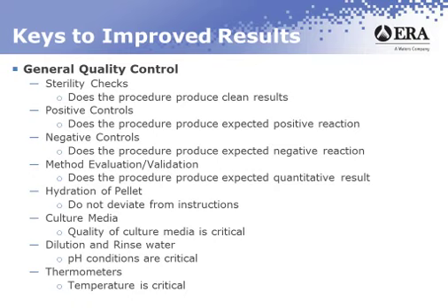Water baths, you want to use ones that have a gabled cover. You want to use circulators. You want to place the incubator in an area of the room where the temperature is relatively stable. You don't want to put it next to the air conditioning vent, or by a window. Those are all things that are going to cause you havoc when you're trying to maintain such a tight temperature tolerance. The air incubators, again, you want to make sure that you're staying within the tolerance.